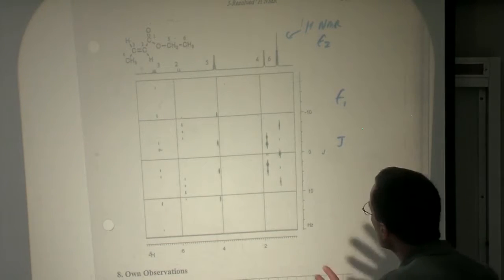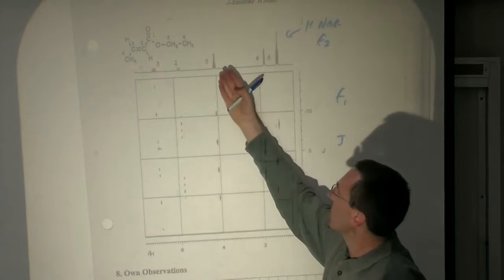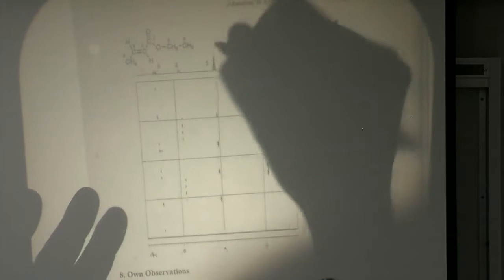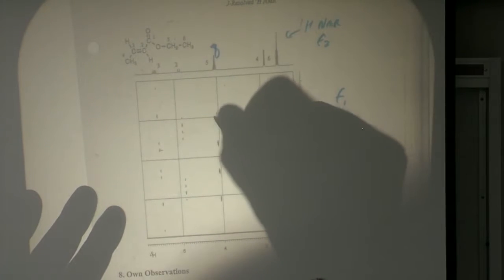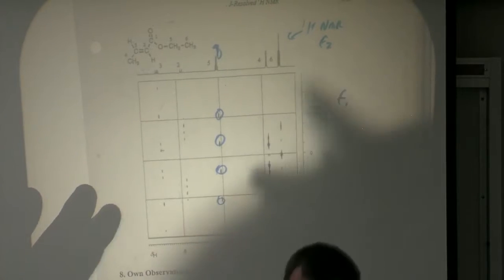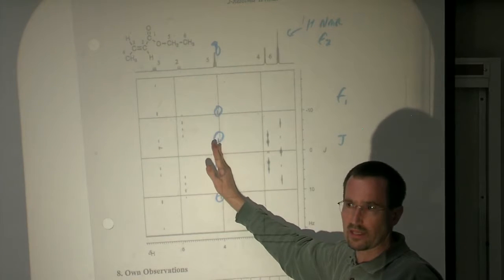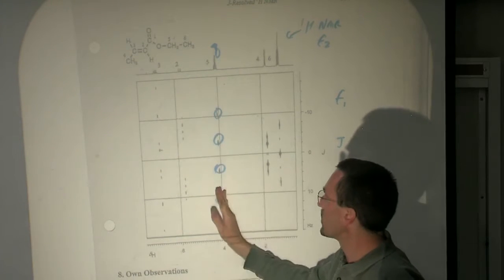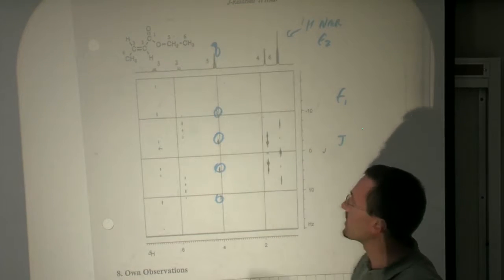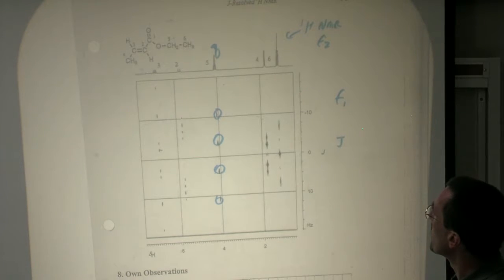And so just so you can see this for the first time, what you have here is basically a projection of the peak like this. In other words, this peak is a quartet, and so along this axis, we see 1, 2, 3, 4. And if you want, of course, on the spectrometer, you can then go and get this out separately and basically go along this dimension, because remember, these contour lines are basically peaks coming out like this. So this is obviously not a complex spectrum.